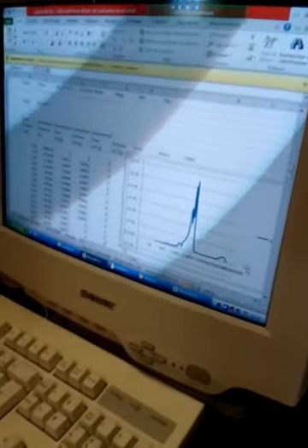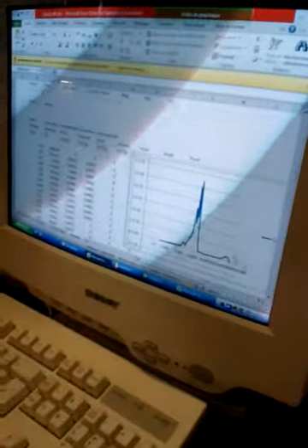Not necessarily less porosity. You can have the same porosity, exactly the same as shown there, about 45%, here 44%. So it could be the same porosity, but with bigger pores.